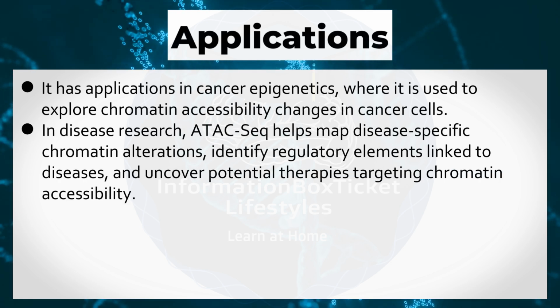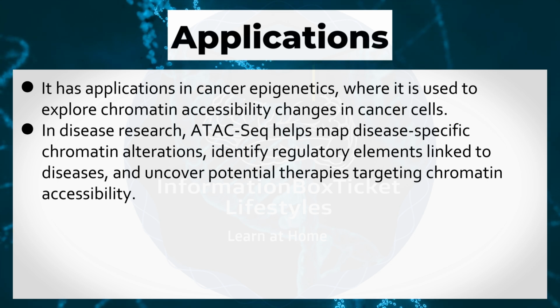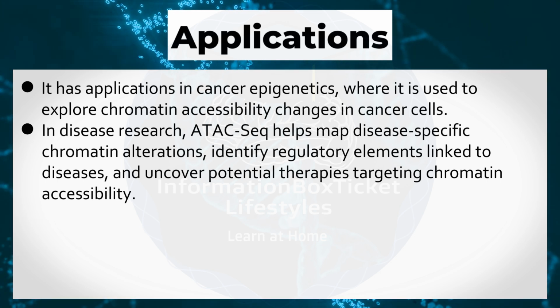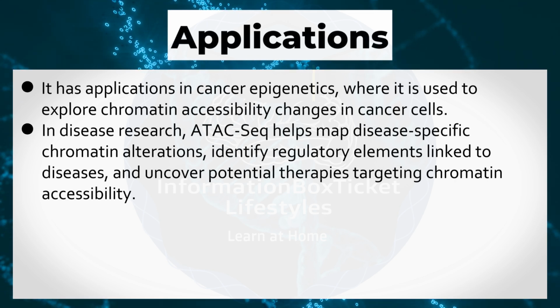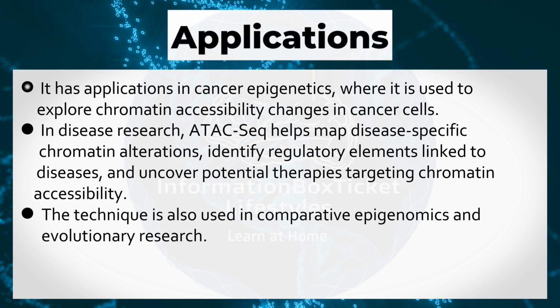In disease research, ATAC-Seq helps map disease-specific chromatin alterations, identify regulatory elements linked to diseases, and uncover potential therapies targeting chromatin accessibility. The technique is also used in comparative epigenomics and evolutionary research.